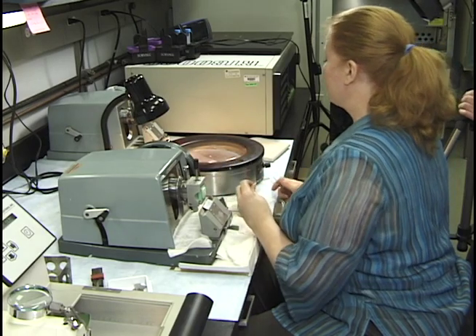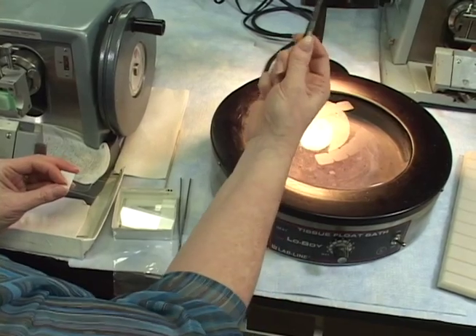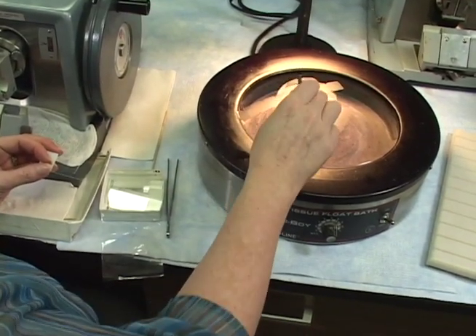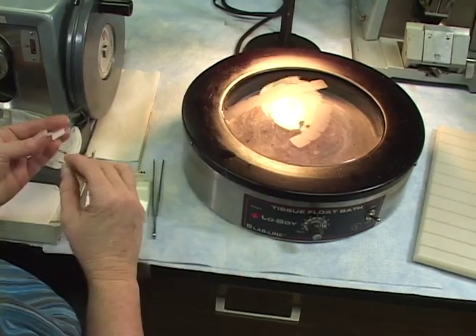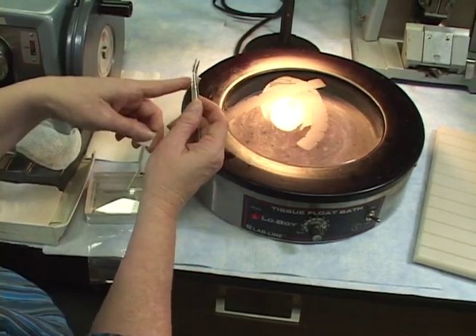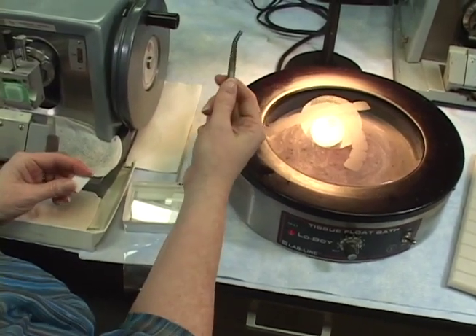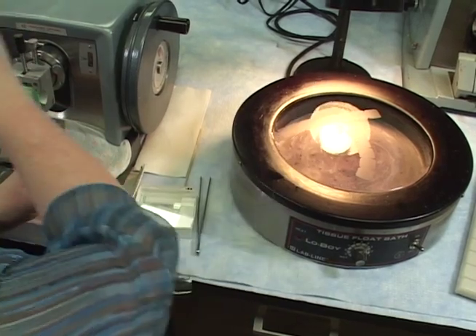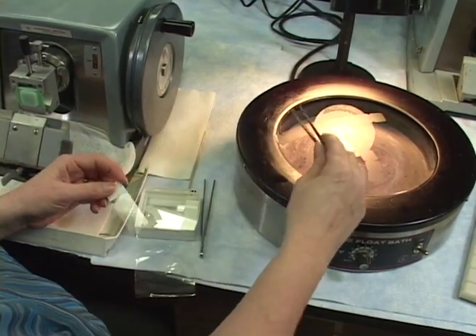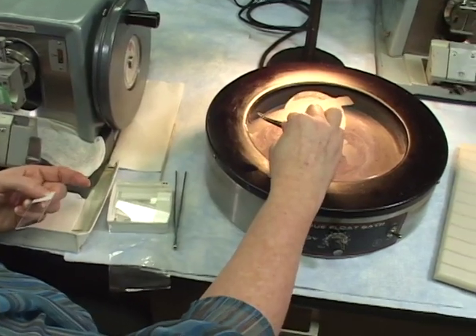For picking up the ribbon, once the tissue is flattened nicely, I use these forceps. Now when I break a ribbon apart, I don't use the tips of the forceps. I tend to use this rounded edge. If you find the forceps are sticking, you can give them a quick dip into the ice water just so they're not warm and sticking to your ribbon. So I use this more rounded edge for breaking the ribbon apart.